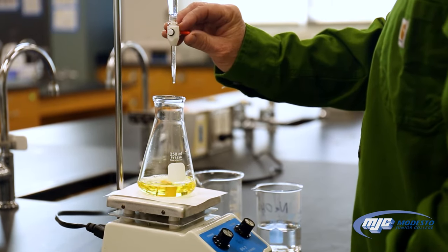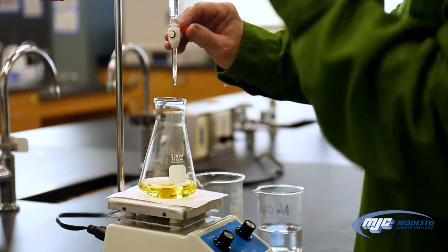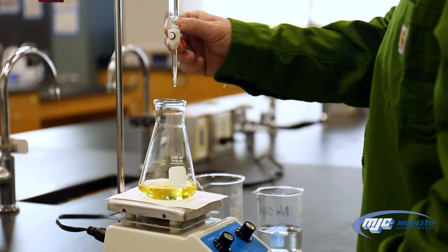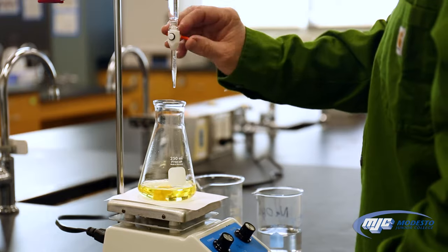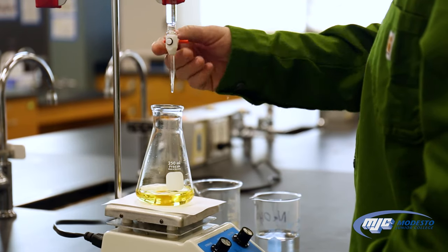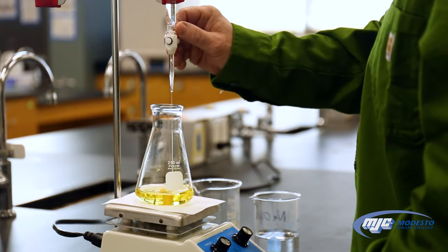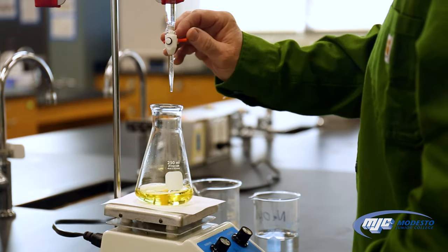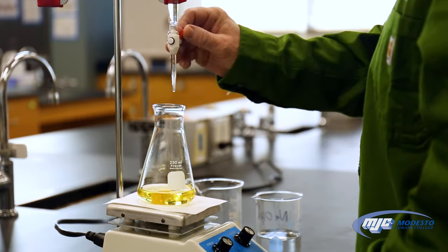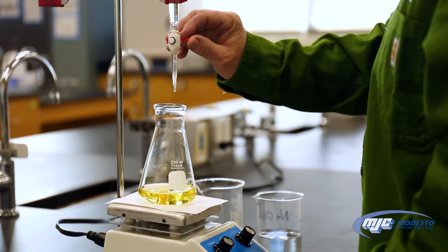Now it's starting to last a little bit longer, so I'm going to go a little bit slower by turning faster. You'll also notice I have a piece of white paper underneath — that helps to see the color change more easily. The color is lasting a little bit longer now, which means we're getting close, so I'm going to go slower by twisting faster. Each time I wait for the color to disappear before I twist again.